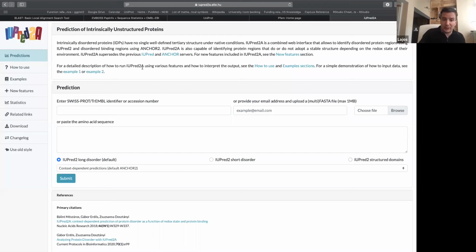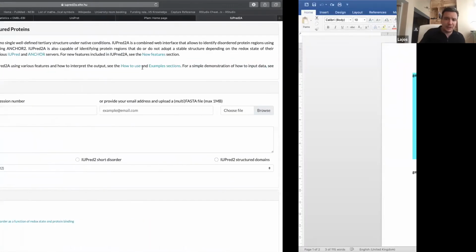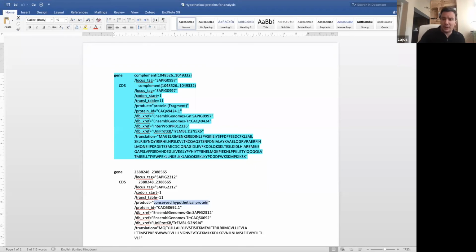The reason why, yeah, I think I started saying that and didn't finish. The reason why Prokka or any other annotation program will give you a non-definitive product name or gene name or protein name is that, of course, they are not specific for specific organisms. So if you are interested in E. coli, then you have a much higher chance to get back more definitive gene or protein names than if you are interested in something like a soil commensal bacteria.